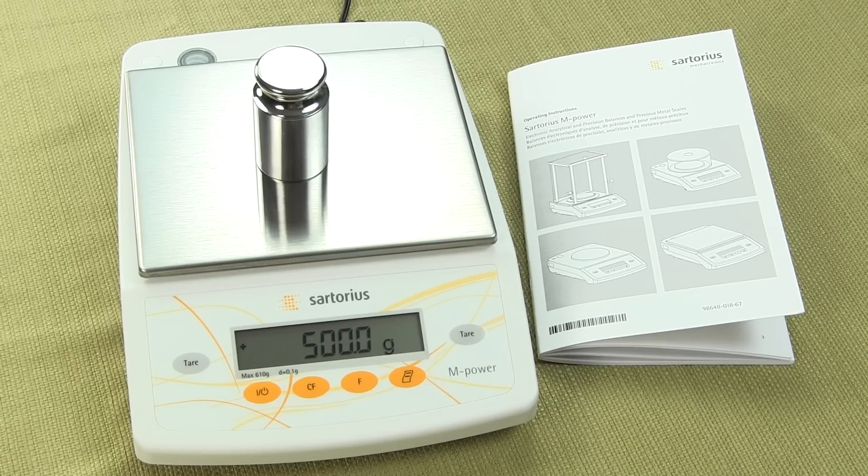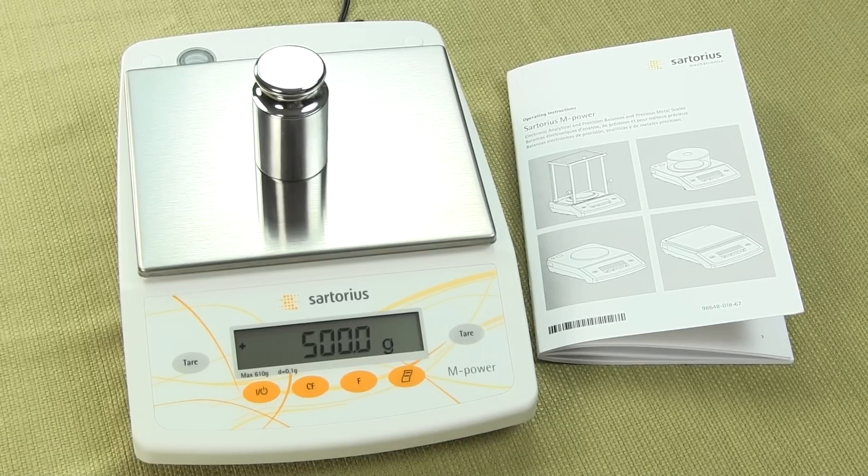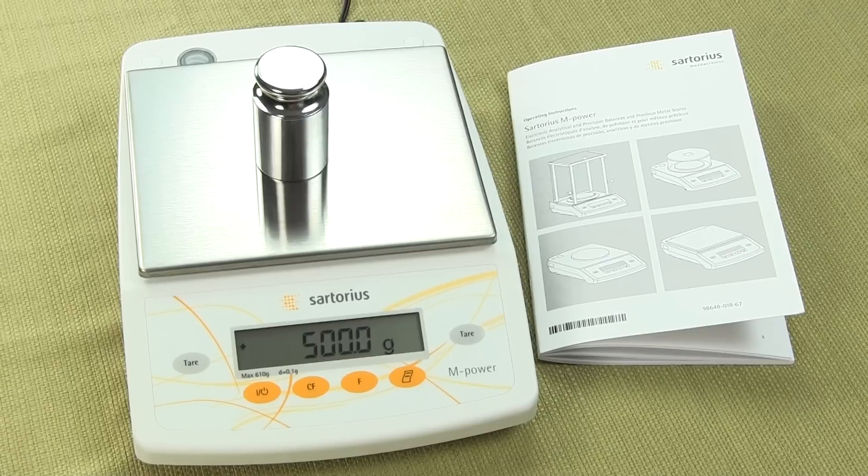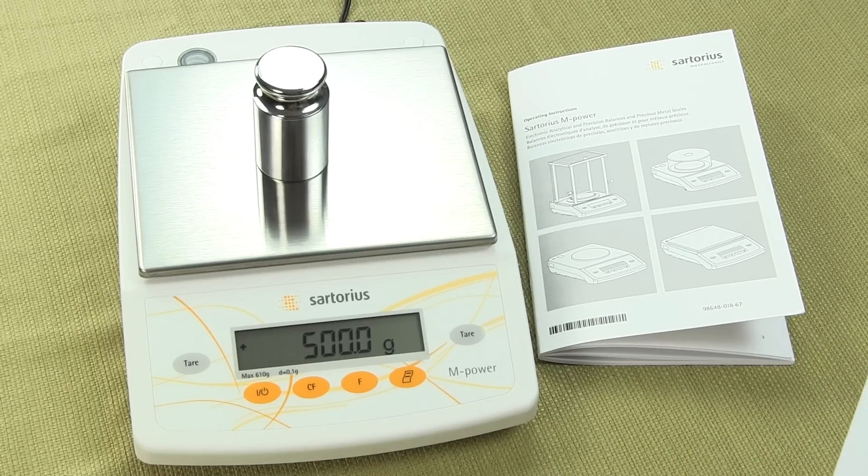The M-Power replaces Sartorius's Talent Series. So if you ever owned a TE digital scale, the AZ replaces it. Now why Sartorius calls it the M-Power and yet the model number is an AZ, I really don't know, but that's it. So this is the AZ601.